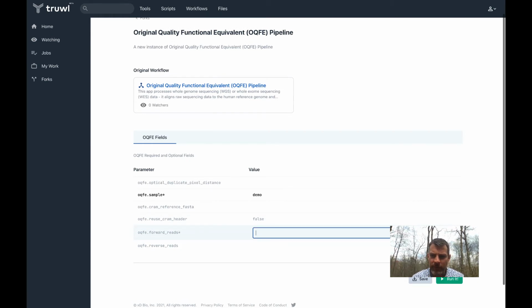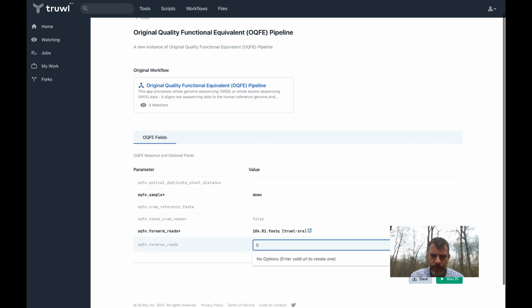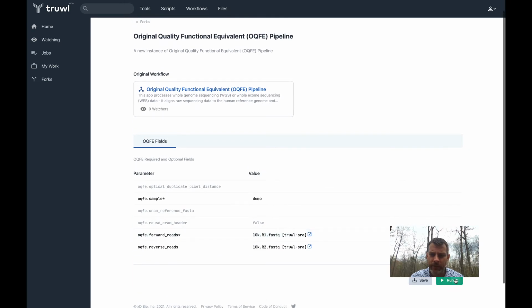So I have some sequences I've already loaded into our library. I'm just going to use those. Make sure you hit check. And this should take about 10 minutes to run.